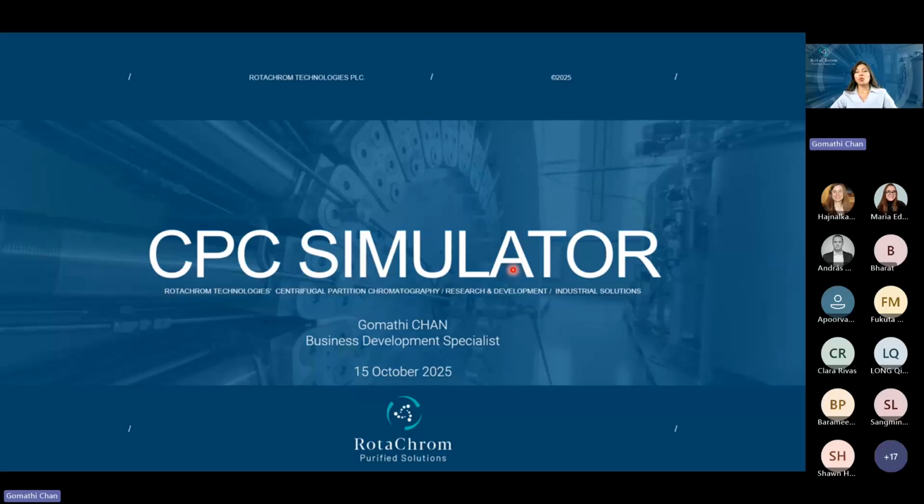If you want to know more details about the centrifugal partition chromatography technique, like how to develop solvent systems for that, method development, and so on, you can always go to our website, visit our homepage and find the related webinars. We have a number of webinars for you to check out there.